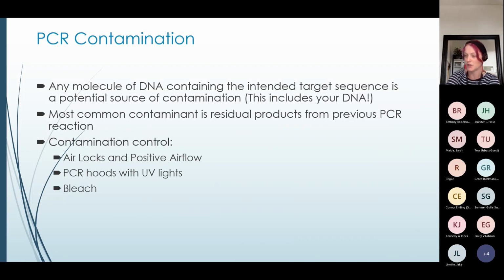But yeah, you want to minimize the risk of especially breaking one of those tubes, because that's where the PCR reaction happened, and you have millions to billions of copies of that gene of interest that are just spewing out in your instrument, and you're like, oh my god, I need to clean this up. Headache. So yeah.